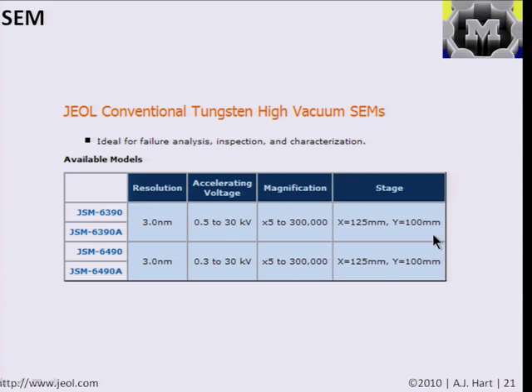And there are many manufacturers of electron microscopes. I just put this slide in to give a flavor: one of the main manufacturers is the Japan Electron Optics company. And when they say tungsten, I think they mean that they're using a tungsten filament. Actually, the choice of filament and the design has a big impact on the characteristics of the image and the limits you may maintain.